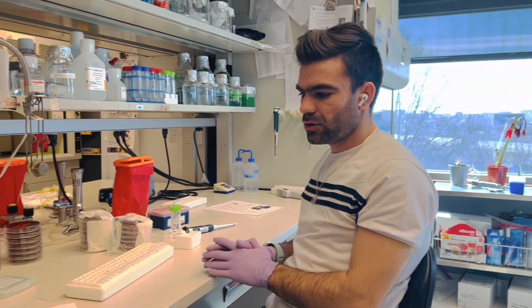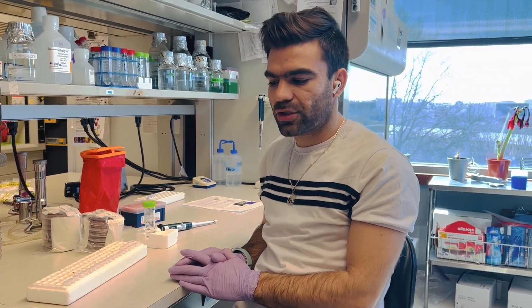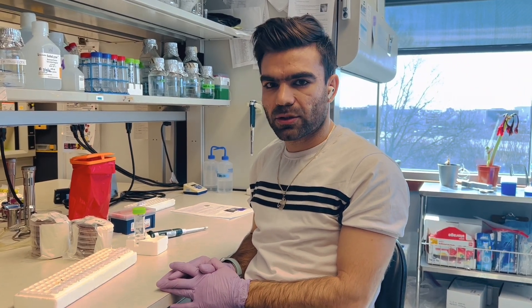In this video I want to practically show how a conventional PCR works and how we can prepare the samples for amplification. So let's see.